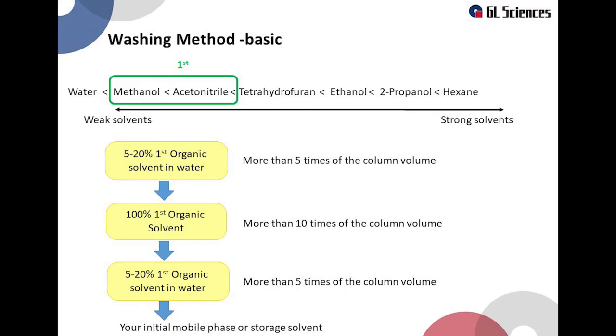Finally, use the mixed solution of water and organic solvent to flush the column. Use an amount of 5 times the column volume. After this, you can use the column under the usual analytical conditions and check whether the column has recovered or not.